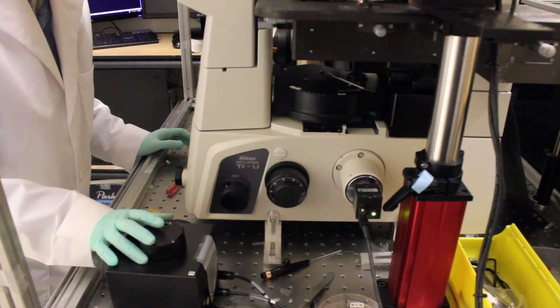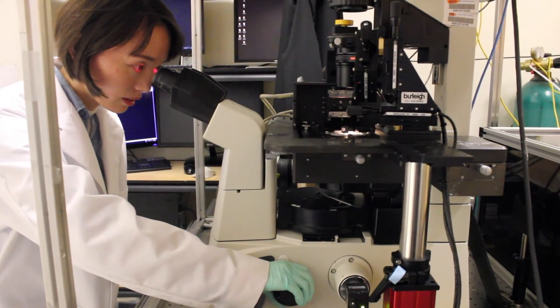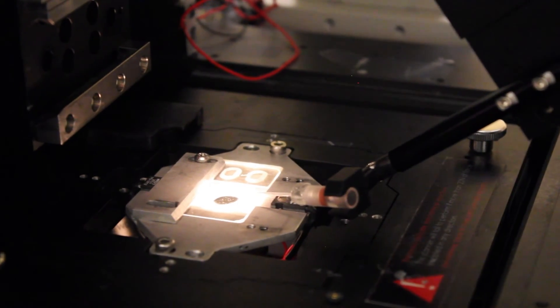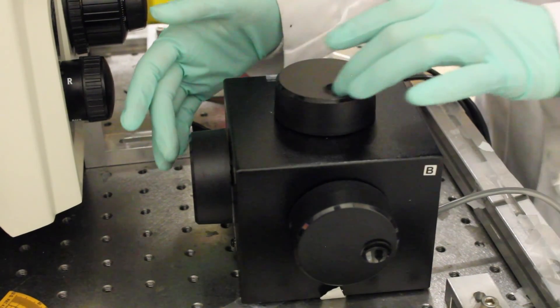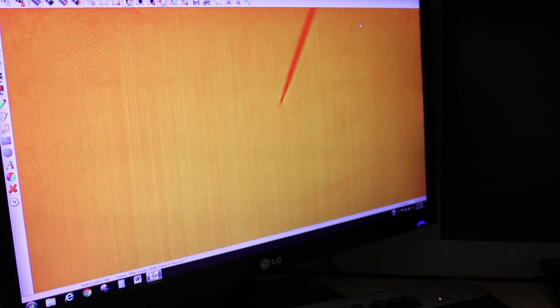Once you've made your pipette, you can move to the equipment. We need to install the glass nanopipette on our micromanipulator so it can control the pipette's approach to our sample. Here is the stage of the micromanipulator. On the cover glass, there should be a cell on it. This can finely control the pipette with around a few hundred nanometers of precise resolution. From the optical image, we can also see the pipette. Now we use the micromanipulator to move the pipette.